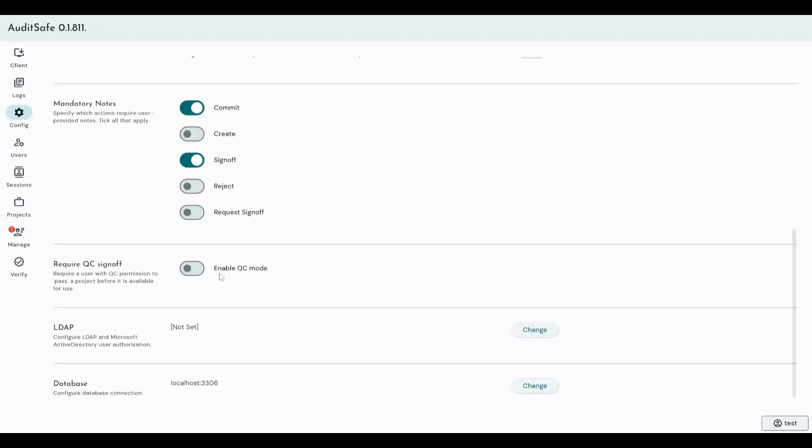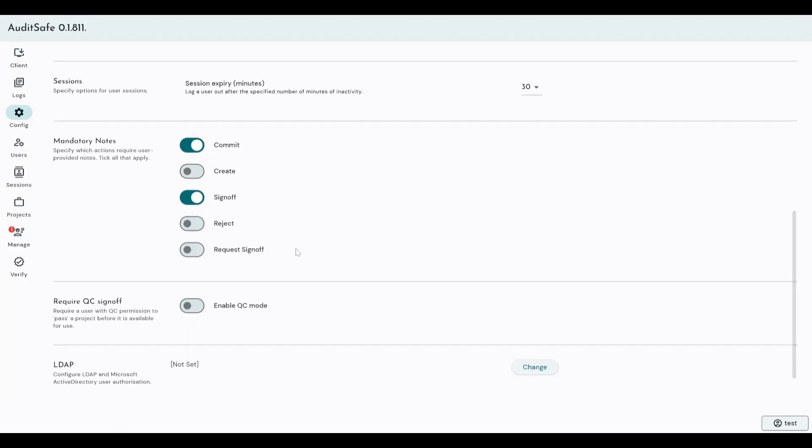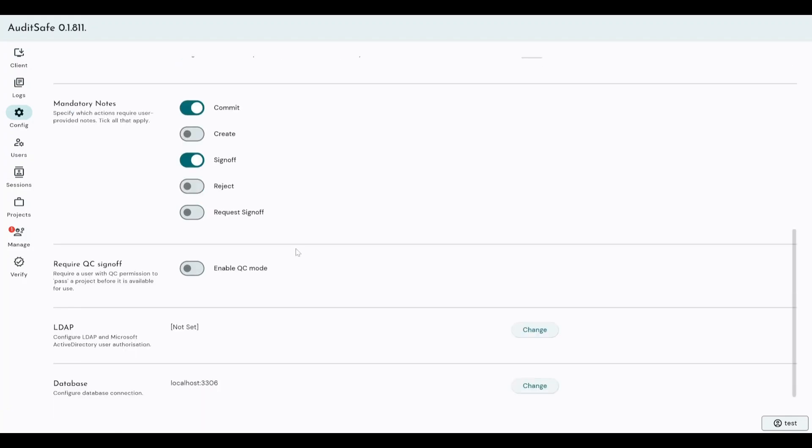So QC sign off is a specialized version of a sign off, which is QC mode, which enforces users once they bring data into the Auditsafe system. They can't analyze that data until someone with the quality control permissions has signed off that data, so has basically said this data is of good enough quality that I would trust any analysis that is done as a derivative of this data. So it can enforce a certain level of quality control before any analysis is performed and minimize any wasted time performing analysis, which may take a long time on data which is considered poor quality. So again, it's super useful for QC labs and in techniques whereby quality could be extremely variable in terms of data.